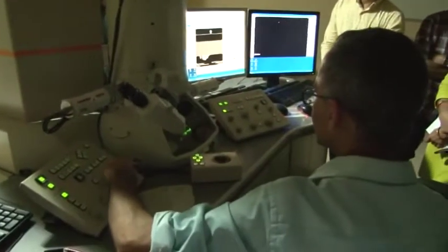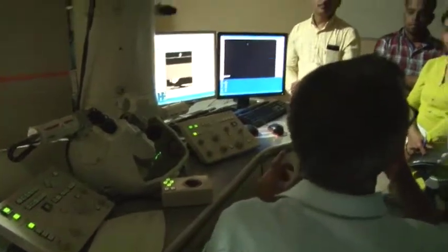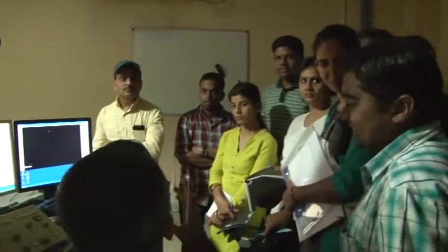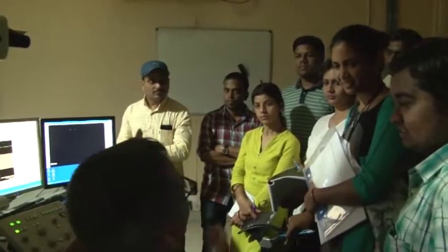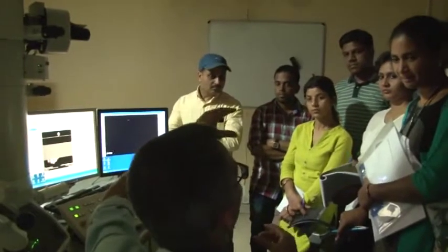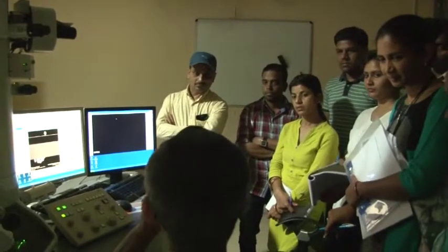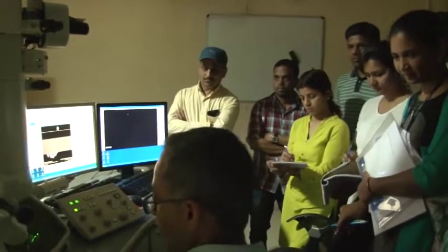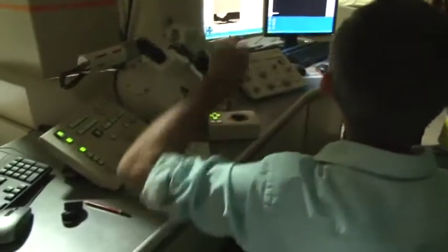Condenser lens two converges the beam. The question is important in the sense that there are two lenses, and even Professor Benjamin explained to you that the condenser lens system consists of condenser lens 1 and 2. Here there are two controls: one is the spot size, and the other is this knob. One of these is for condenser lens 1, and the other is for the other one. Which one is which, I do not know at the moment.